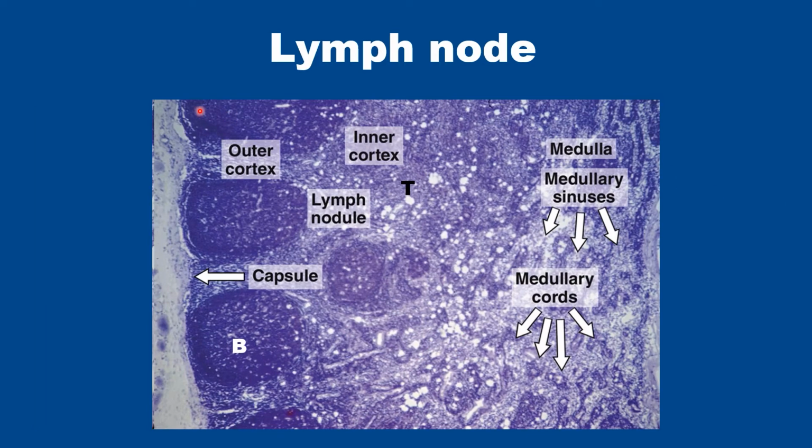This is showing part of the section of the lymph node. The outermost part is covered by the capsule, which sends some fibers inside.